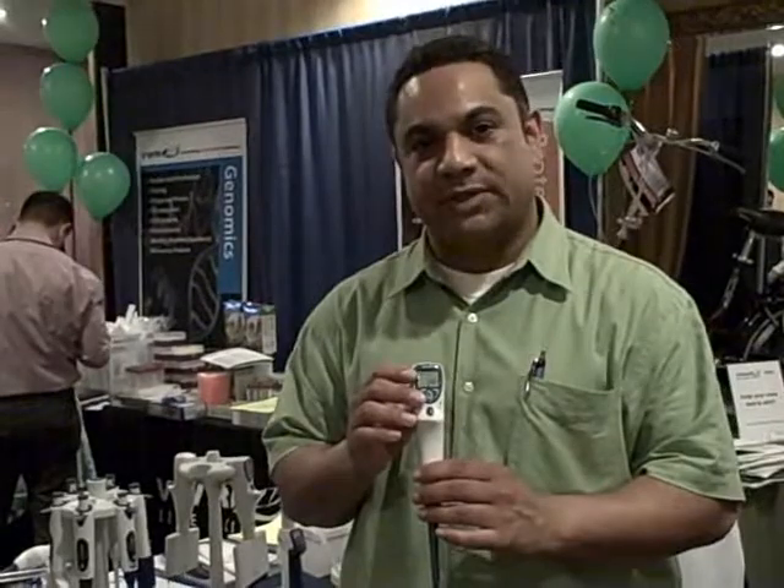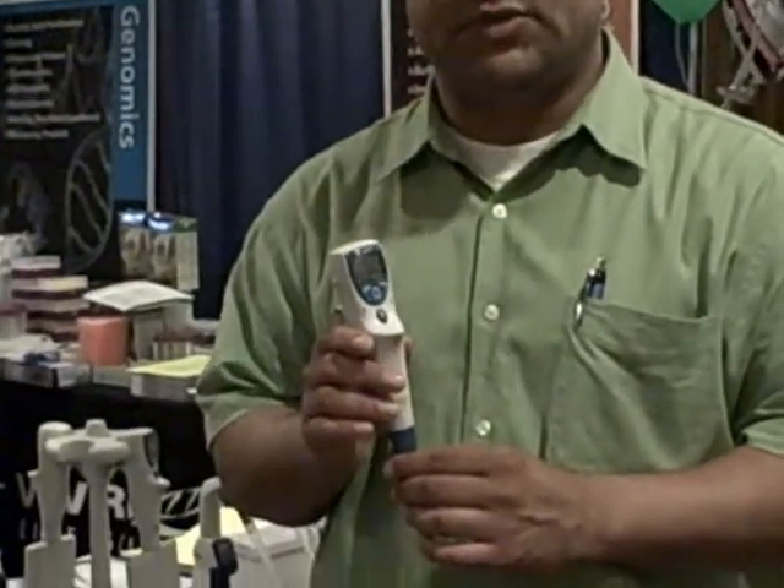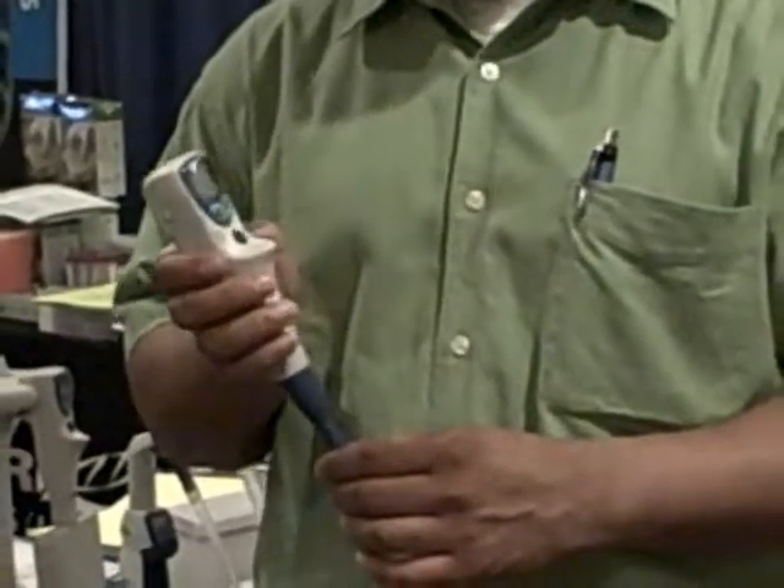Some of the features we do have on this is the electronic pipetter has 12 different modes that you can program into the pipetter, straight up from basic pipetting to pipetting and mixing, reverse pipetting, multiple dispensing and so forth.